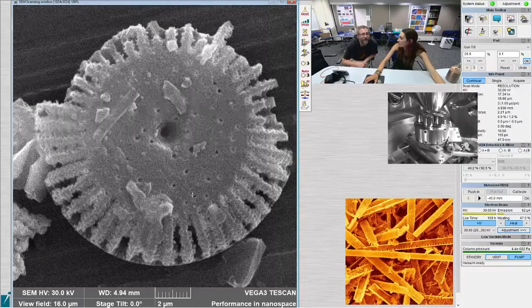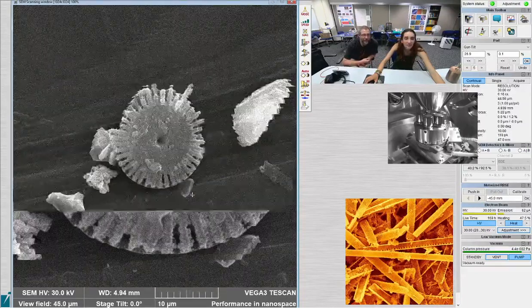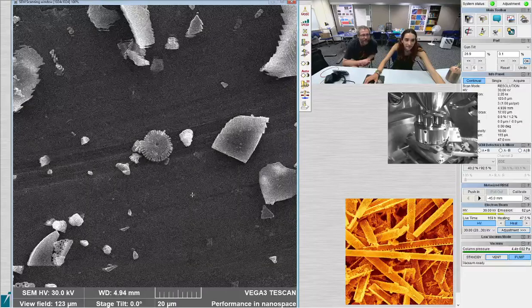Very cool. Not the one we're looking for. No, that's that same cyclotelloid. It's just dissolved.